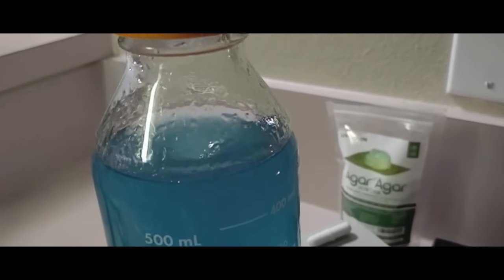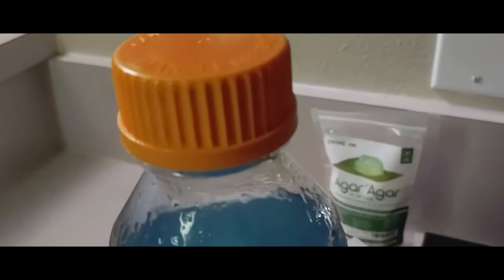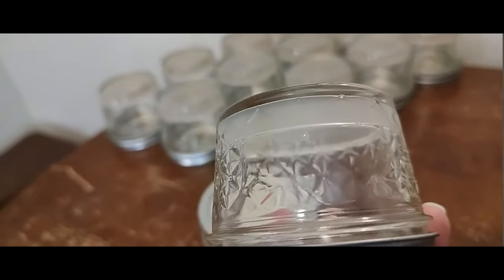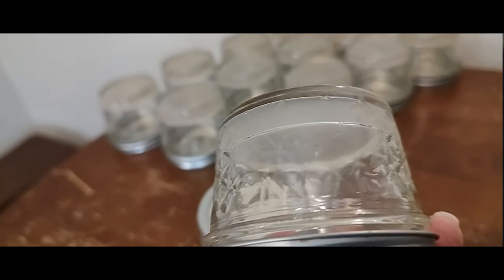When cloning or working with spores, we have found water agar to be the best recipe to start with. We then transfer to MEA plates, then a final transfer to MYA gives us the rhizomorphic growth we desire.